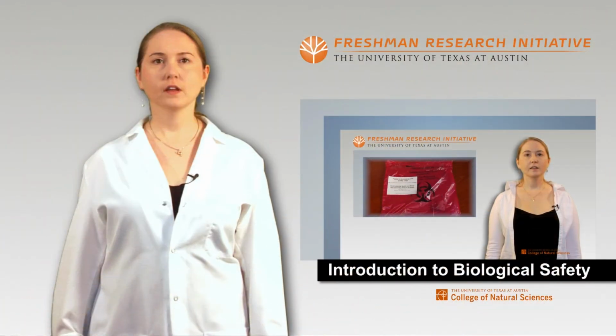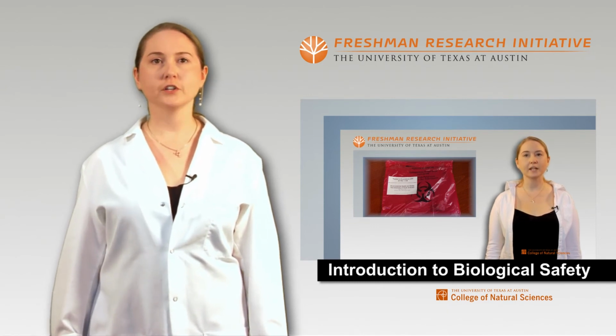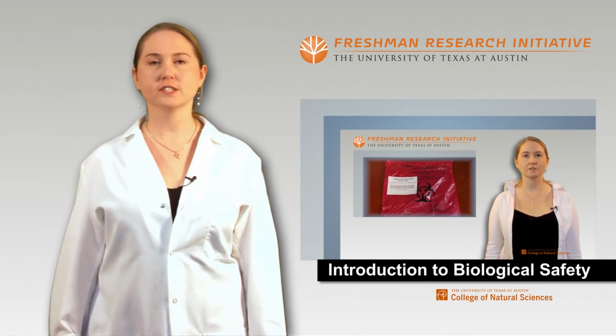Preparing biological waste and sharps for pickup is covered in the Introduction to Biological Safety video.